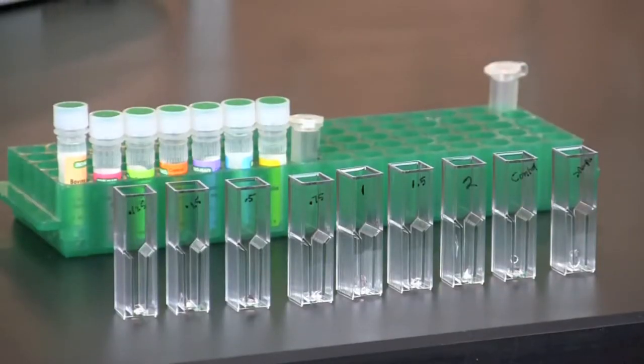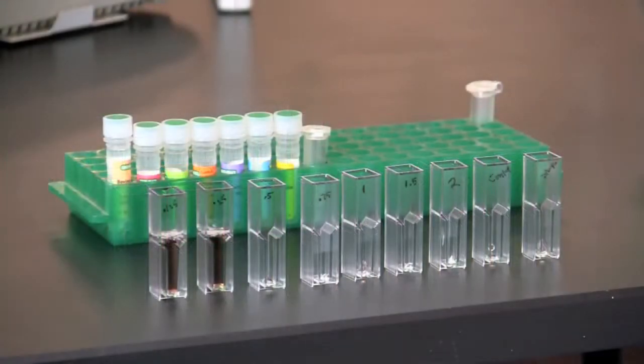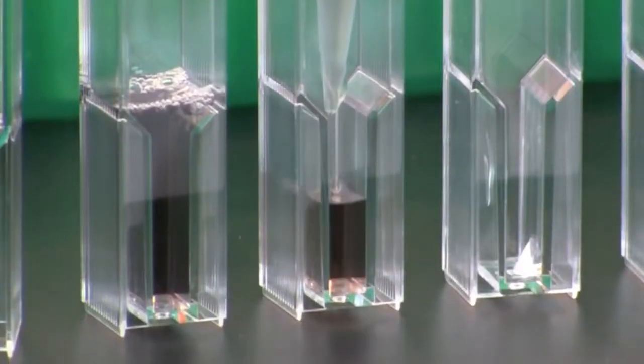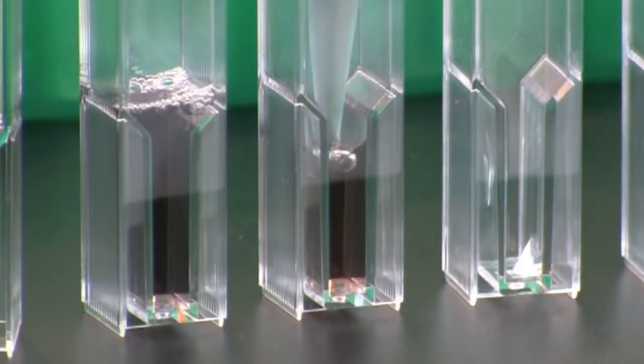Now you are ready to add the Bradford reagent to all of the cuvettes you have prepared including the sample and control. Add 1 milliliter of 1x Bradford reagent to each of the cuvettes. Mix completely by pipetting up and down with the micropipette.